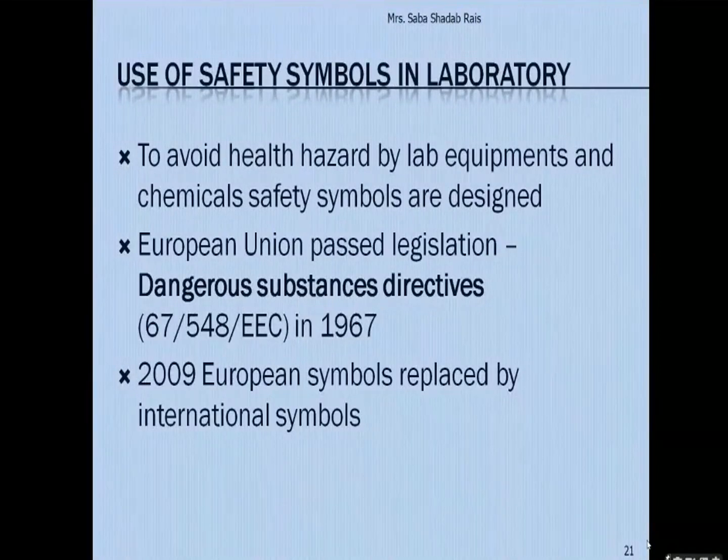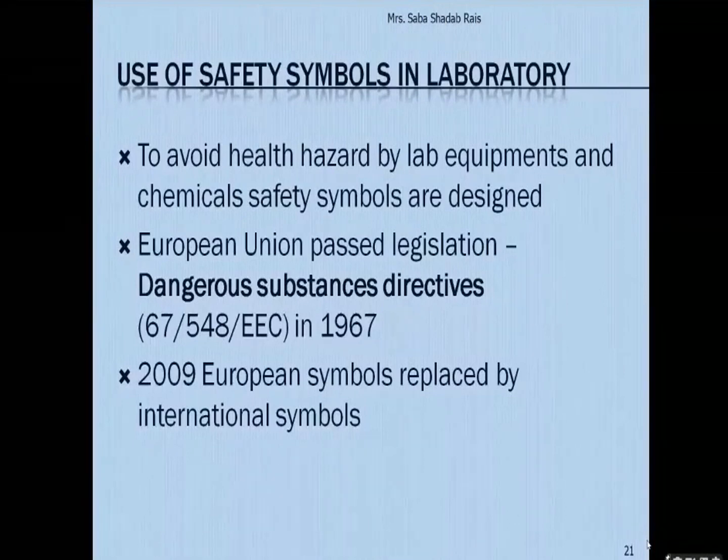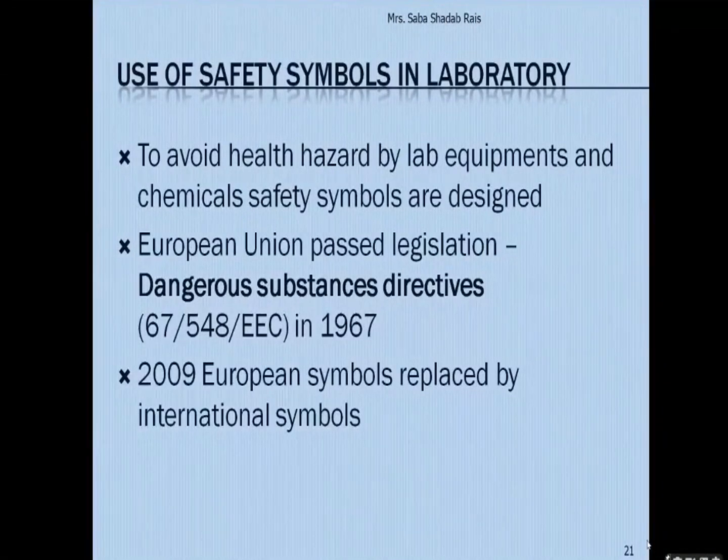But when new advancement has come, many of these chemicals are toxic, corrosive, inflammable, carcinogenic in nature. Similarly, all the equipment made for experimentation is extremely sensitive, for example to electric inputs, and also maximizes the accuracy of the result. There is a need that we should know about these things. And if you are very new to handling chemicals, at least there must be some symbols. This increases the risk of both students as well as teachers working in the laboratory. They do not follow the recommended precautionary measures correctly, right?